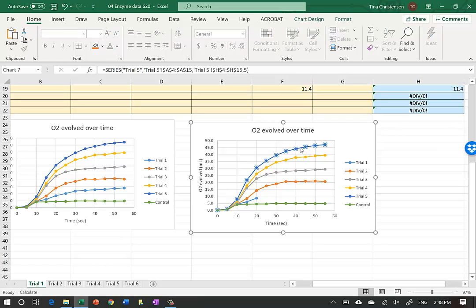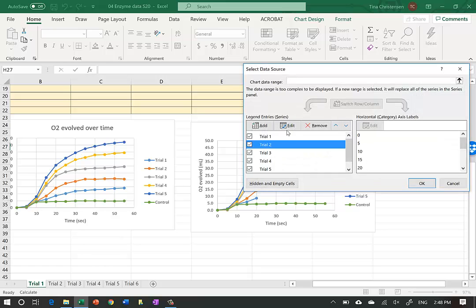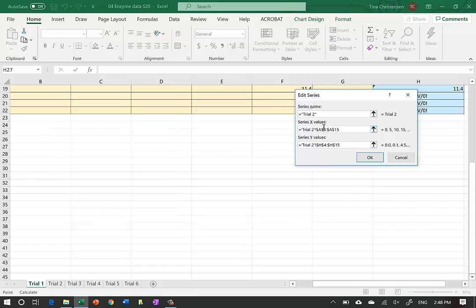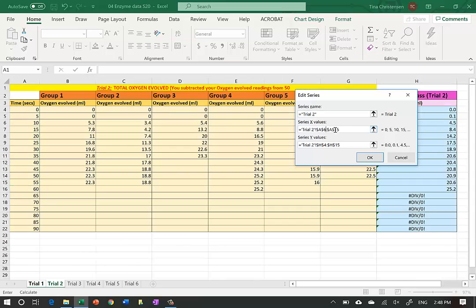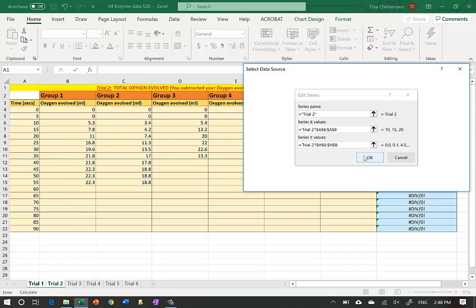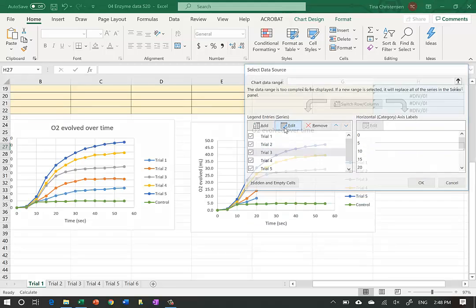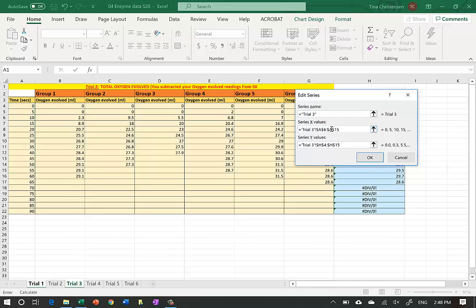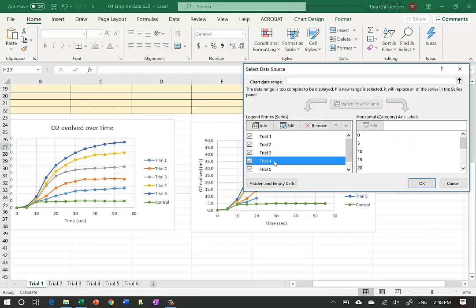We do this with all trials. Right-click, Select Data, edit Trial 2 - change both X and Y ranges to rows 6 and 8. Then do the same for Trial 3 - rows 6 and 8 for both X and Y.